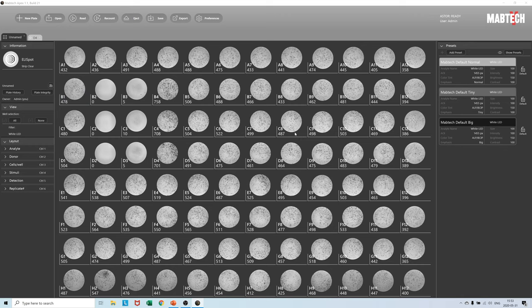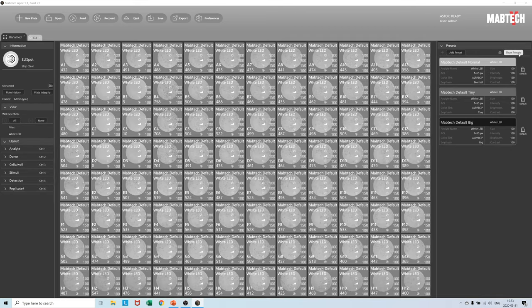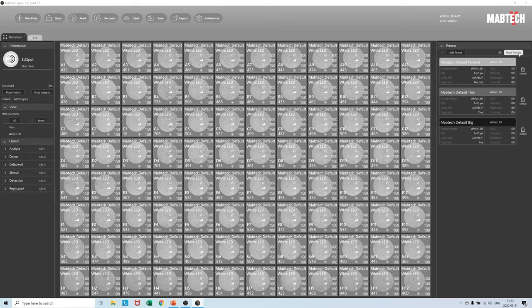Let's go back to plate view and explain something fundamental about how the preset system works. We can press the show preset button and get an overview of how the presets are currently divided in the plate. Here Mabtech default normal is used for all 96 wells.